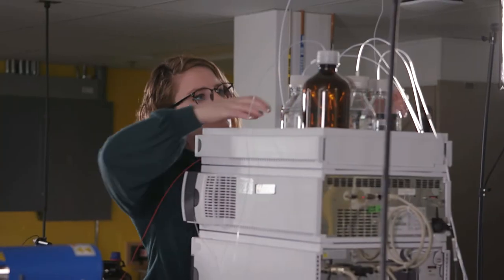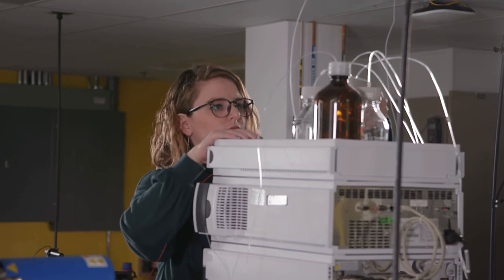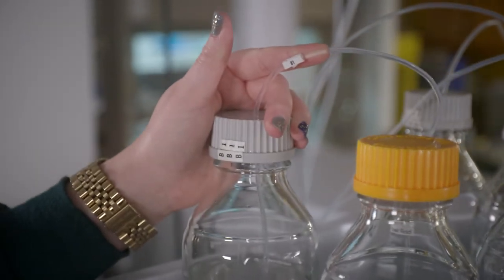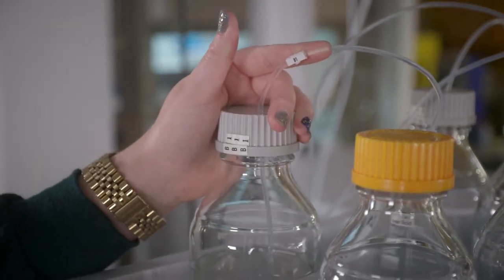For this demonstration, we will run our caffeine sample with methanol as our eluent on the B1 channel.